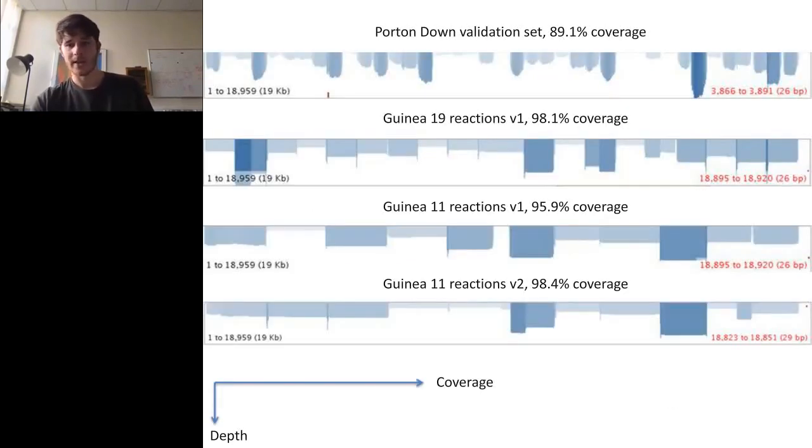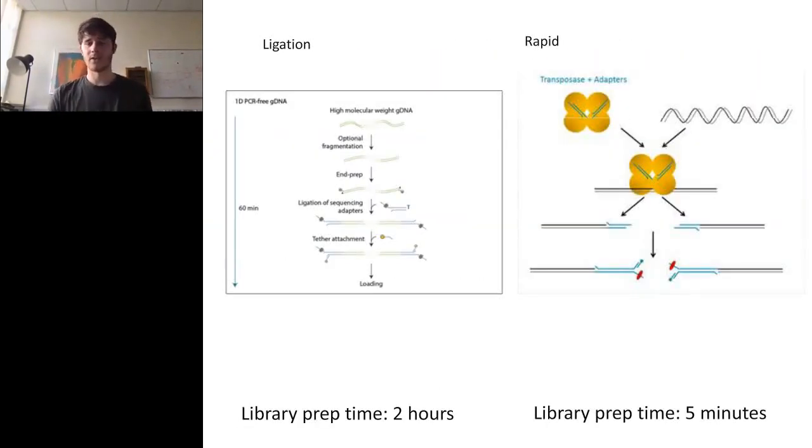So, to quickly say how you then go from a PCR product to the sequencer, there's two main types of libraries that you can do for the MinION. If you have amplicons, you want this type of library because you've already got double-stranded amplicons, and really what you want to do is just stick on these adapters onto the end, so starting at the step where the arrow is, and then create these products which can then be loaded onto the sequencer, which contain the motor on the adapter.